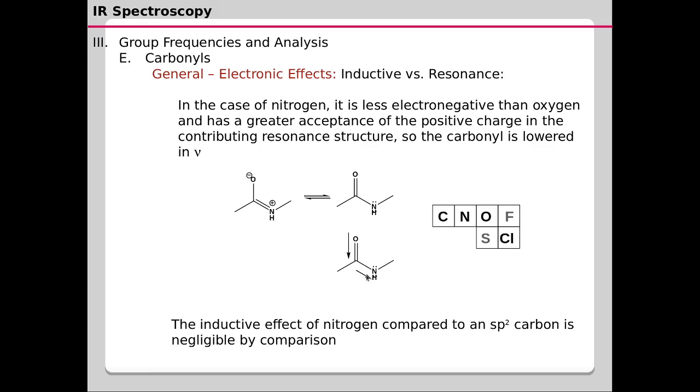So compared to the previous molecule, there shall be a lesser magnitude of electron density flow towards nitrogen. Okay, so as a result, the carbonyl carbon will not be as delta positive as in the case of the previous molecule, which results in a lesser pulling of the sigma bond electron density towards the carbonyl carbon. Okay, and again that results in a lesser stiffening of the pi electron density. The pi electron density in the carbonyl functional group will be stiffened to a lesser extent compared to the molecular system that we saw in the previous slide.